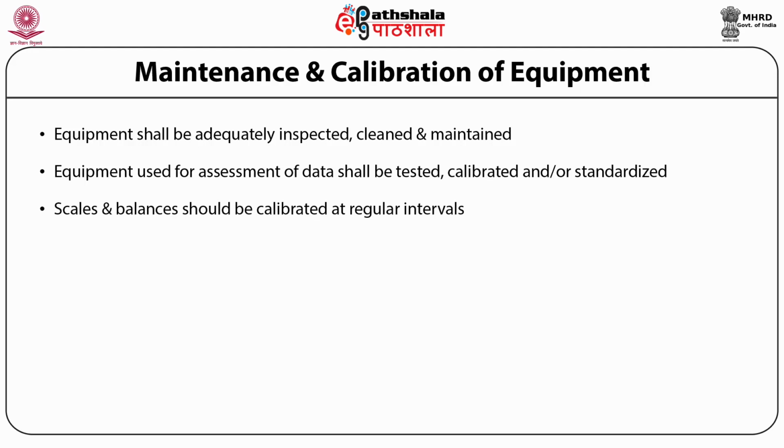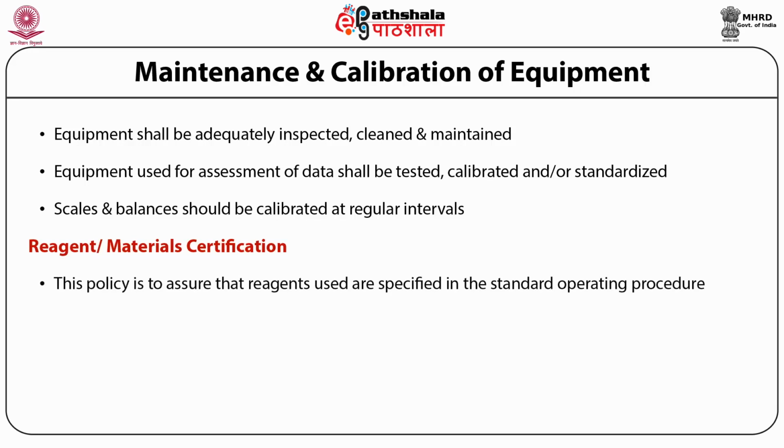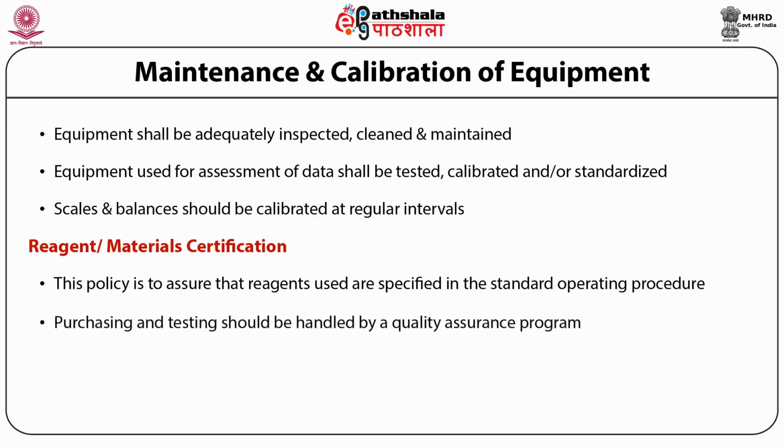Now, for reagent and material certification. The policy for this certification is to ensure that reagents used are specified in the standard operating procedures. The reagent and materials purchasing and testing should be handled by a quality assurance program.